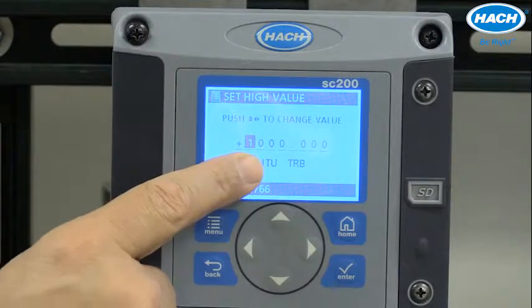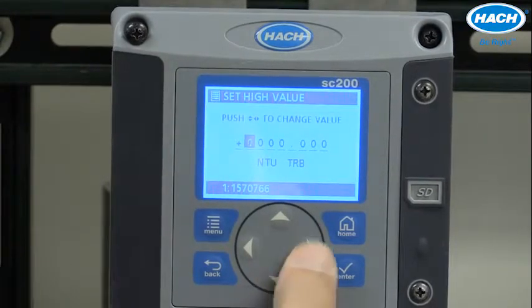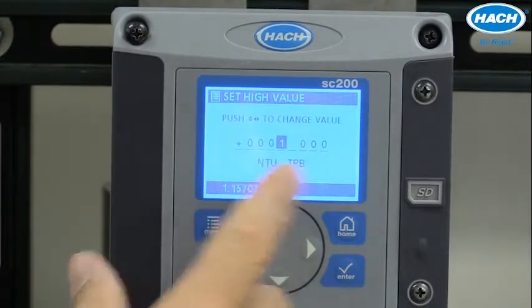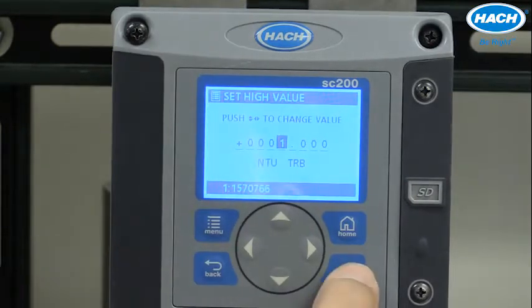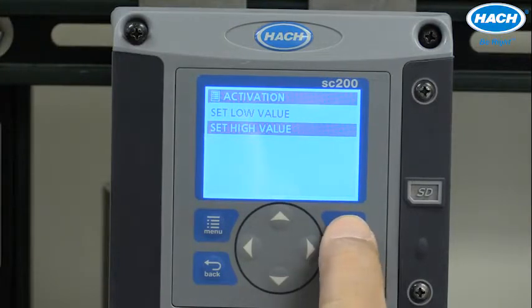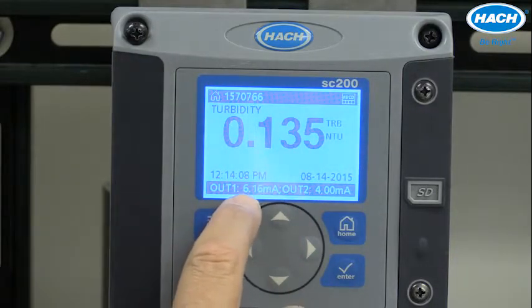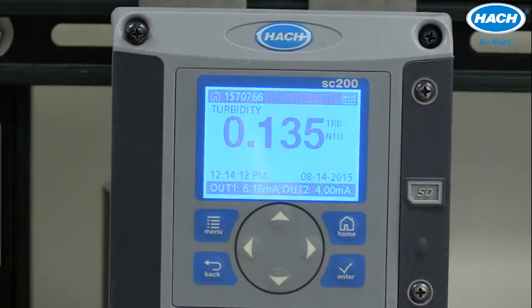If we used 1,000 NTU, we would probably have poor resolution in the analog output. So we'll change this to a more appropriate value — something like 1 NTU. The user can decide for themselves what's appropriate to convey possible turbidities while still retaining good resolution. So 1 NTU we'll use, and that's it. We can go back to the home screen by pressing home, and our turbidity value is now being output at 6.16 milliamps, which is appropriate for the way it's been set up.